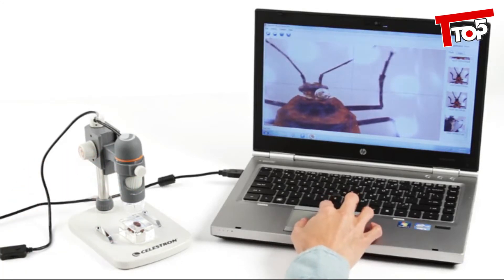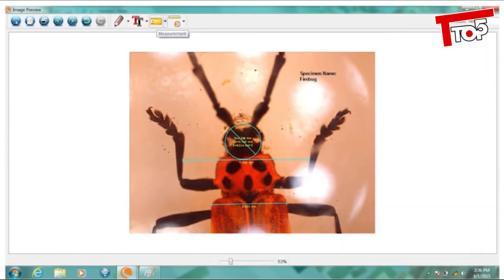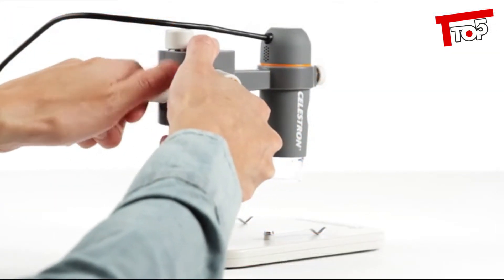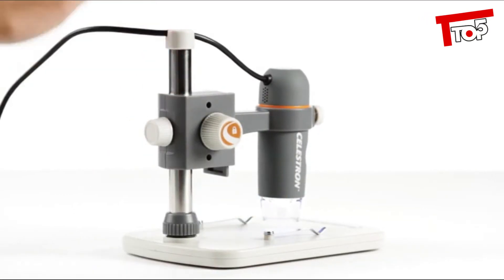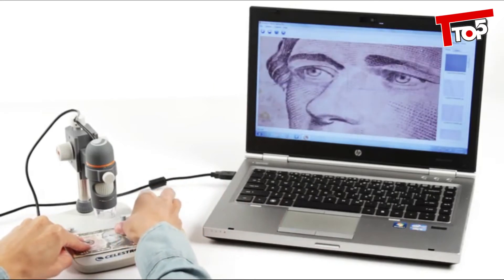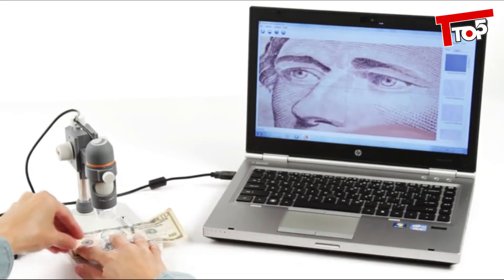It's a beautiful tool for capturing high resolution images, VGA video, time-lapse animations, and more. Plus, you can measure the size of your specimens, make notes, and save images directly to your hard drive. Another great feature only available with the Handheld Digital Microscope Pro is the easily adjustable, sturdy stand. The stand stage provides the perfect platform for your specimens and includes metal clips for anchoring flat objects like paper documents and stamps.